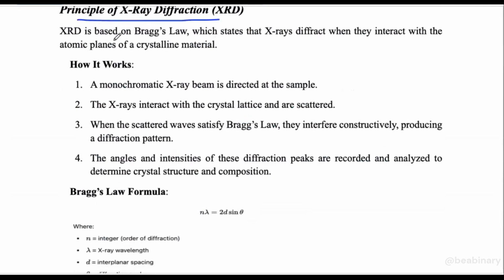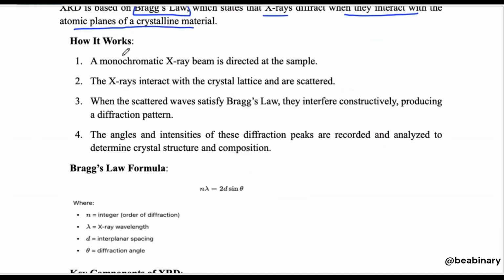X-ray diffraction is based on the law known as Bragg's law. The law on which XRD works is Bragg's law, which states that X-rays diffract when they interact with the atomic planes of a crystalline material. This is the statement. How does it work?